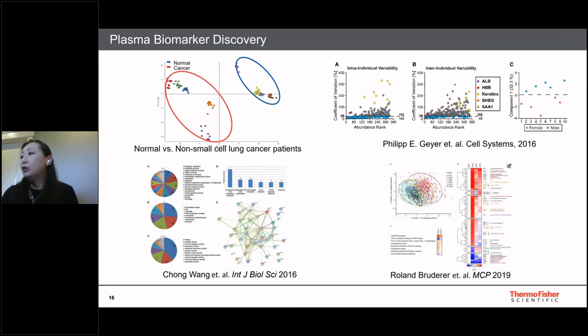With a large human cohort, here is 1,500 plasma proteins. This study looked at dynamic changes of plasma protein for weight loss and maintenance at 4 different time points. This is a longitudinal study of biological process during the weight loss and maintenance.